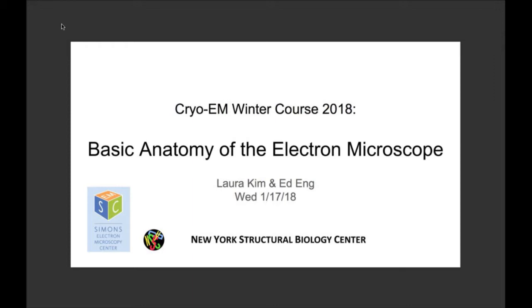So today we have a staff member here, Laura Kim, and she'll be telling you a lot about the ins and outs of microscopes, especially microscope parts. And this is crucial in the sense that if you're an artist, you want to know the tools of your trade. And in terms of EM, they are quite critical because a lot is glossed over. There are a lot of things that are very similar to physics and optics, but there are certain things that are different, and we'll cover that quite shortly.